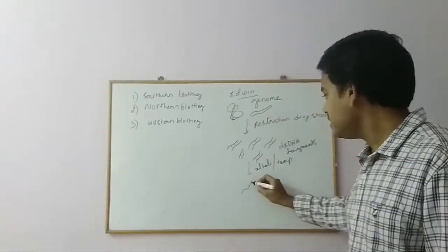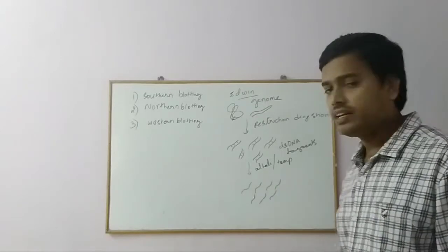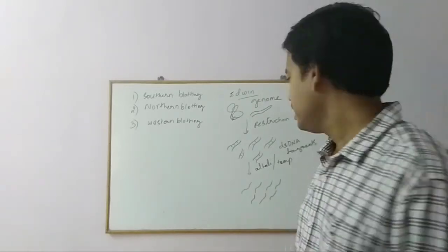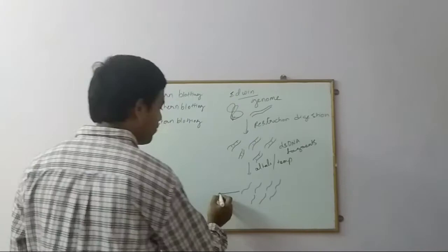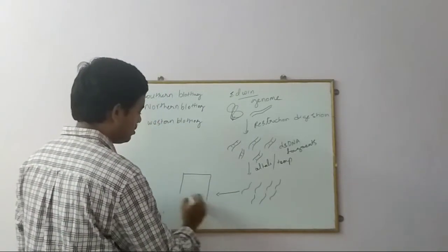Now you get the single-stranded DNA fragments, and these are subjected to electrophoresis.